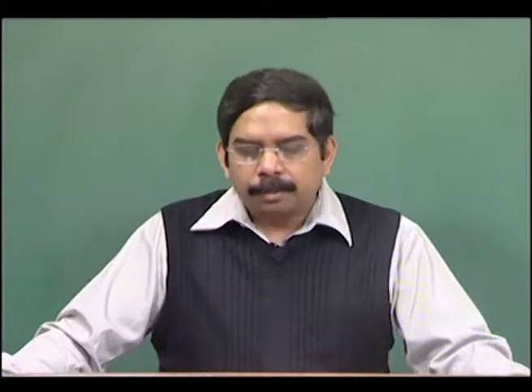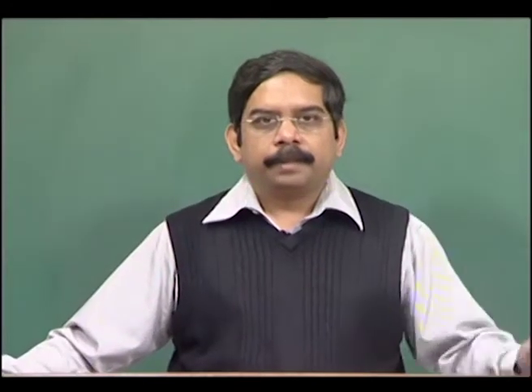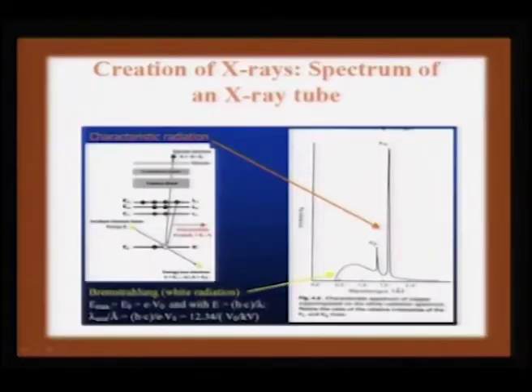So, we will look into what the principle behind this spectroscopic tool is, and if there is something very highly complementary to X-ray diffraction, it is the spectroscopic tools. And as you would see in this lecture, there are several spectroscopic issues that are manifested when X-rays are emitted, and how this can be mapped and how we can translate this into quantifying some results, we will see in the next few slides. And to start with, let us see how we create X-rays and how the spectrum of an X-ray tube is generated.